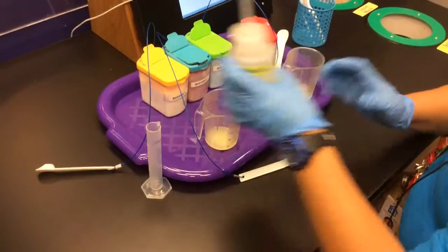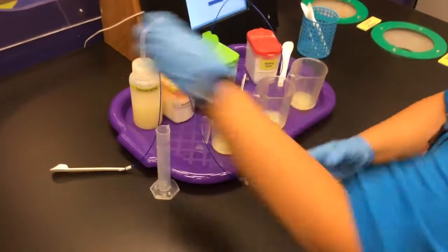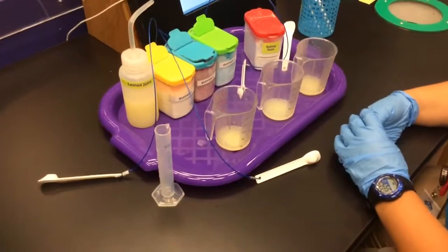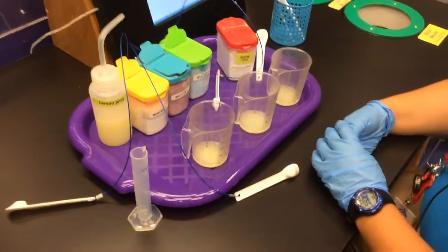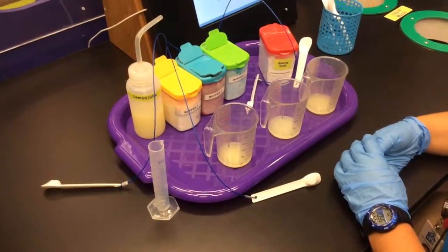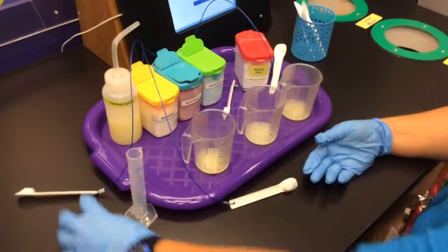Okay, so at this point, we've added our acid, so we're done with our acid. We can put it away. We have an even amount of acid in each beaker. Our next step is to add a buffer to each one. We're going to add our sample buffers.